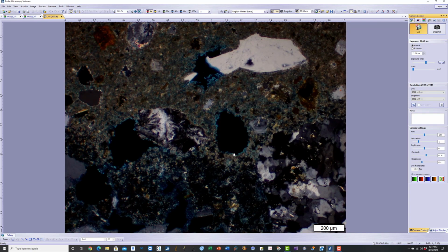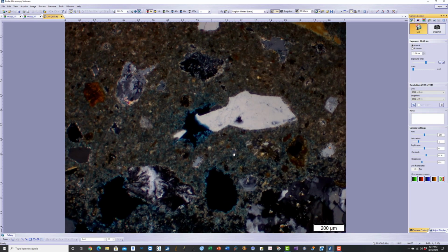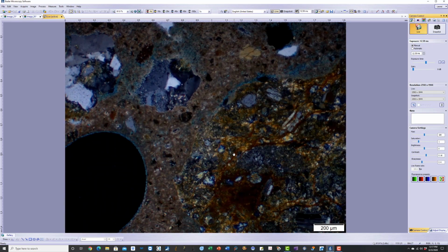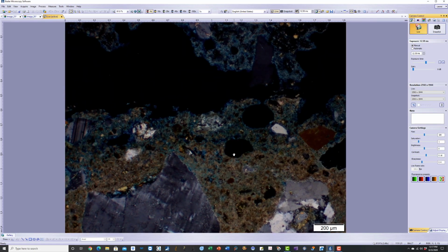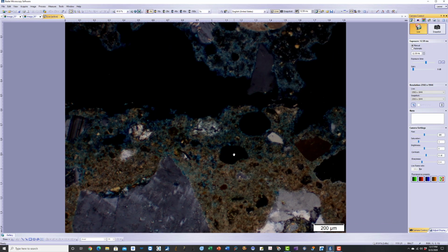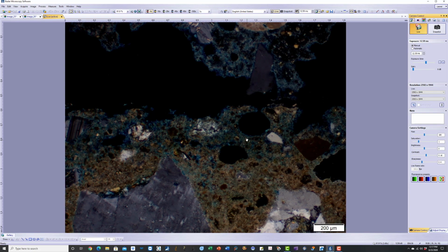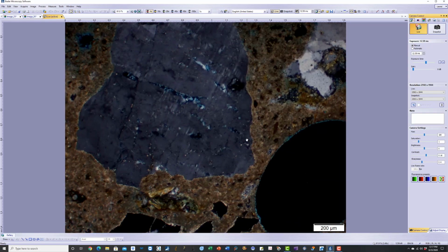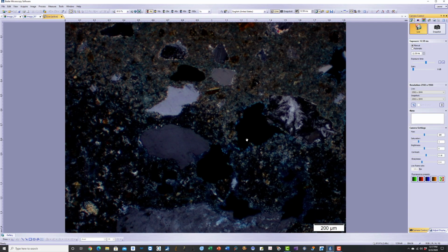this is the boundary between the interior and the carbonated portion of the concrete. And then carbonated portion goes from porous carbonated portion to denser carbonated portion at the very top. And after the denser carbonated portion comes another top layer of porous carbonated leached portion. Then comes the mortar coating. So we have a zoned microstructure from leached porous surface region carbonated, then dense carbonated surface region, then less dense carbonated surface region, then non-carbonated interior concrete.